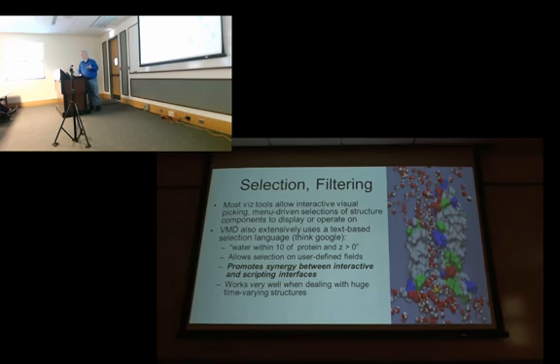Many of the molecular visualization tools you may have seen in the past would have used visual selection techniques. Like you might click on something and then it would change its representation, show it or hide it, things like this. VMD has a little bit of a different approach. VMD has always used a text-based atom selection, which, for those of you who are big users of Google, which I assume is everybody in this room, is a selection language that is composed of a bunch of criteria, and they can be combined. You can use unions, intersections, differences, things like this.